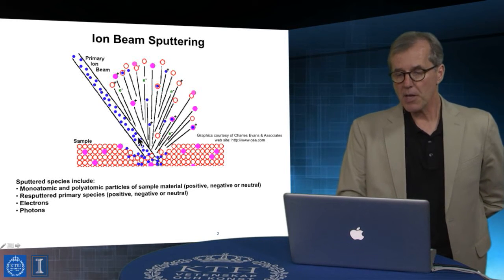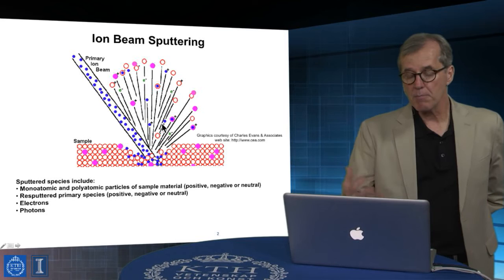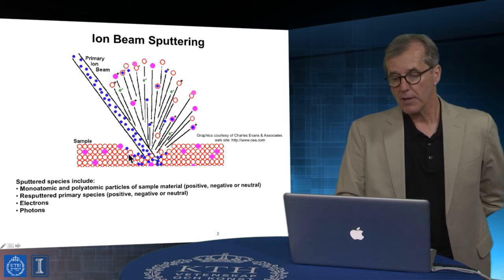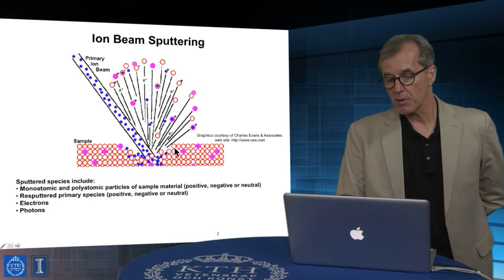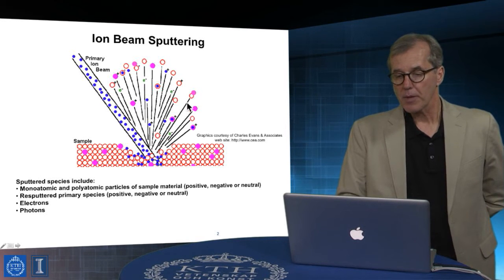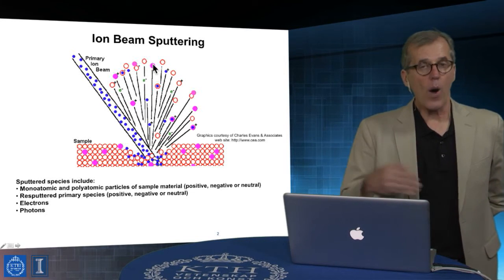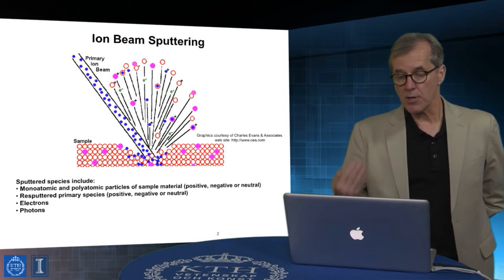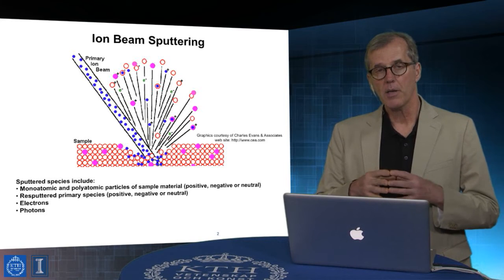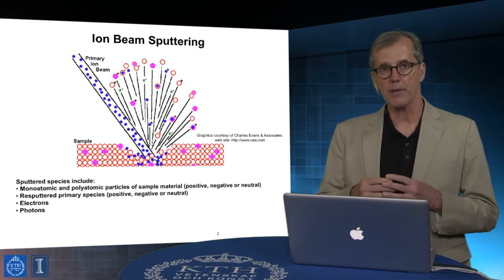And the other part of it is that the flux of atomic components coming out doesn't necessarily have to directly reflect the composition of what's present in the material, because we have to look at whether or not the cross sections for emission of all these various components widely range in their magnitude. Now, just to foreshadow something that we'll talk about in more detail, the cross sections for ion emission in this case vary over many orders of magnitude.